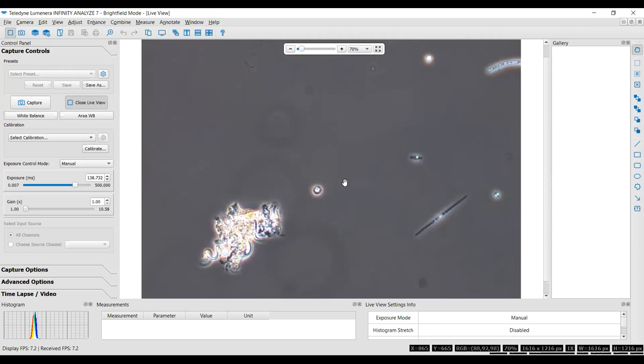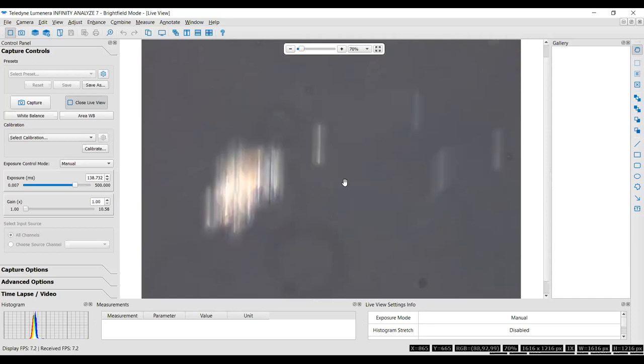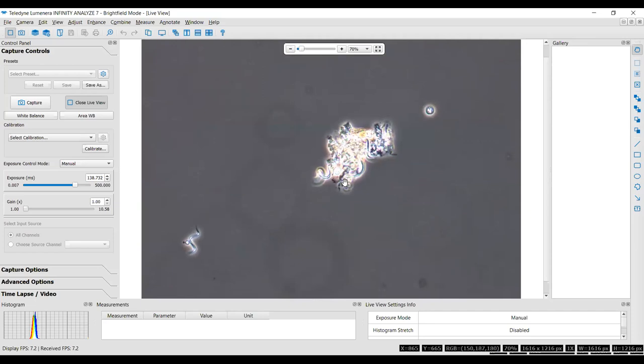That's clearly not a round chrysophyte. It's not a green. That's clearly a diatom. When you turn things like that, it makes it much easier to tell. And then again, here you can tell where these things have aggregated, and you've got a whole lot of these individual little Raphidiopsis stuck with this big clump of stuff.